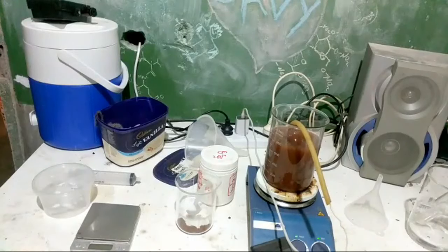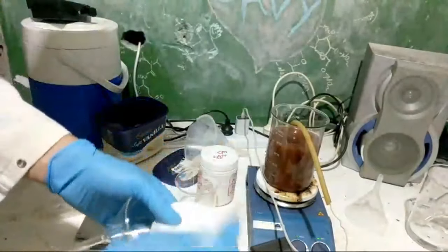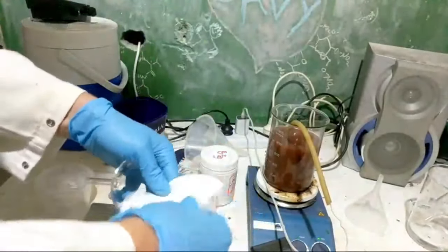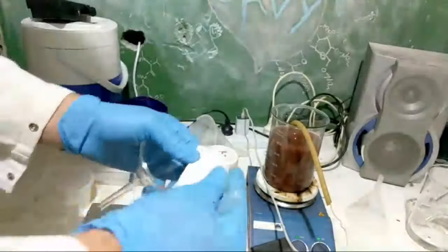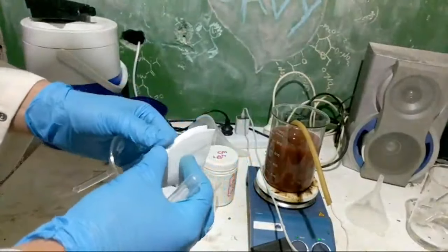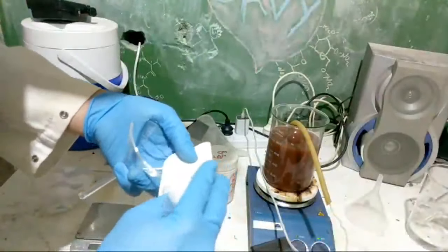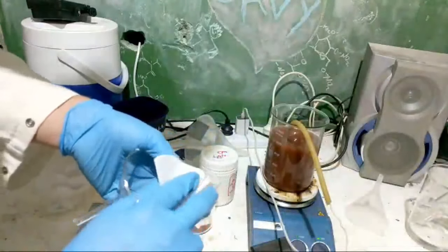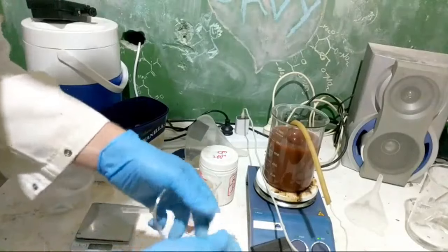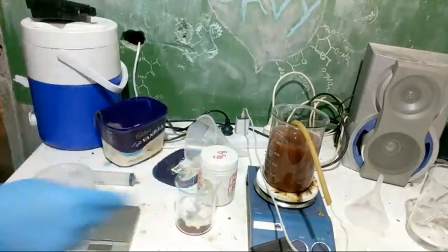I needed some sort of paper. Oh, what is this? Impurities aren't impurities if you pretend that they're the product you're aiming for. Also, how do you complete a chemistry degree and still be so bad at folding filter papers? What trash is this? This song goes well with my inability to fold filter paper. I'll get another beaker.